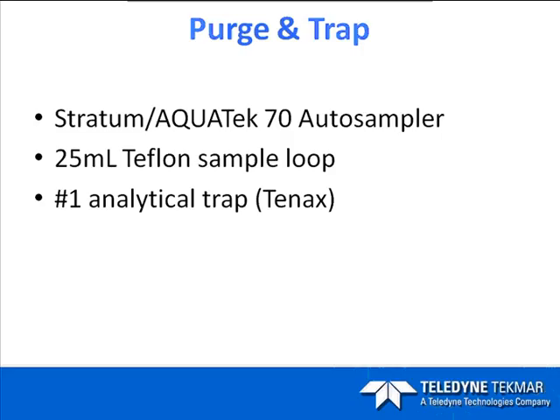When choosing an analytical trap, it must retain the analytes while allowing oxygen and water to pass through. Upon heating, it must be able to release the analytes quickly and efficiently. It must be stable and not contribute to any excess background or cause any types of catalytic reactions.